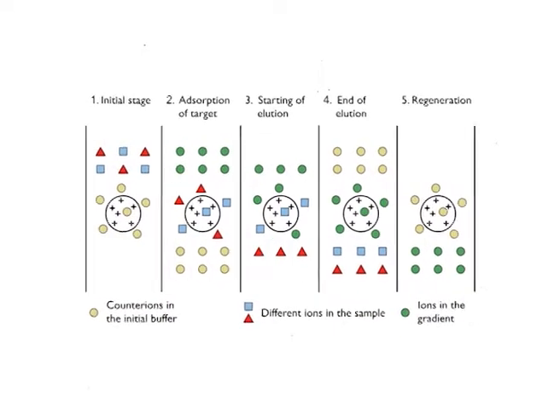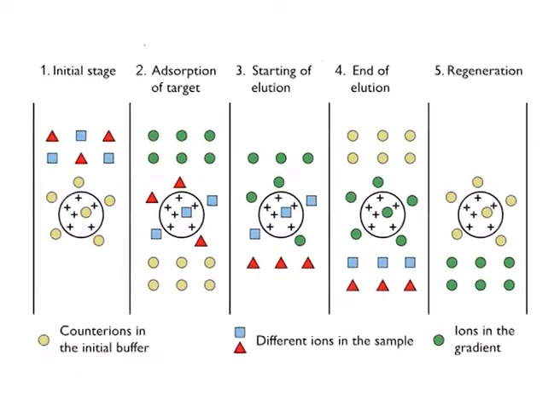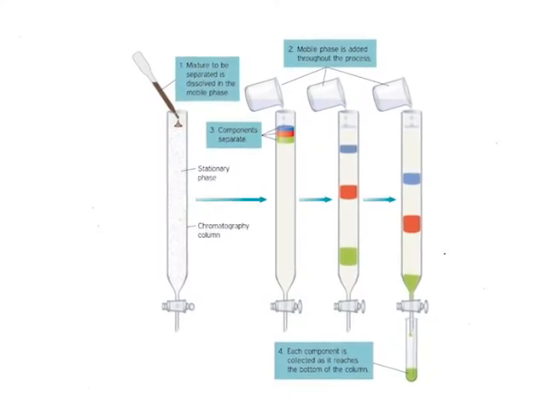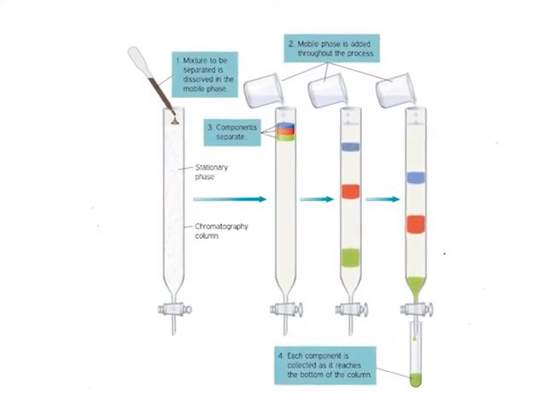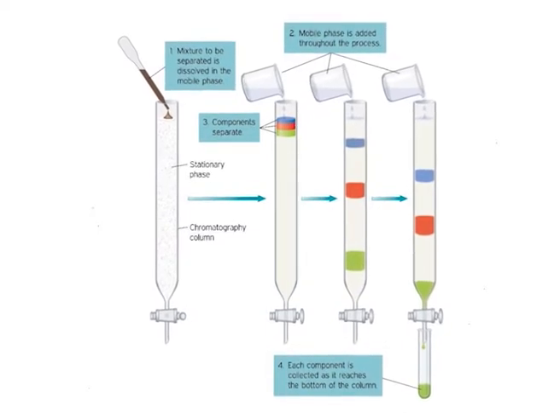Principle of elution. Column chromatography separation involves the stationary phase being held in a narrow tube or a column. The mobile phase or eluent along with the mixture of components, which is the solute, is forced through the tube having the stationary phase under pressure. This process is termed as elution. Eluate is a fluid emerging from the end of the column.